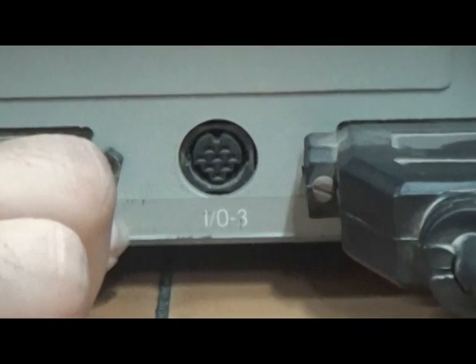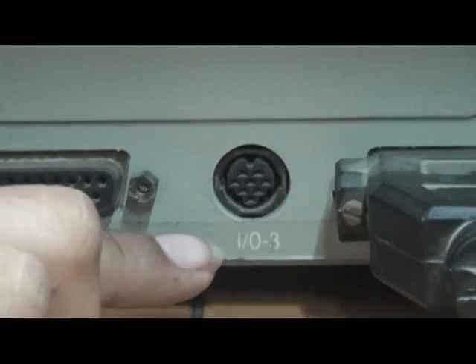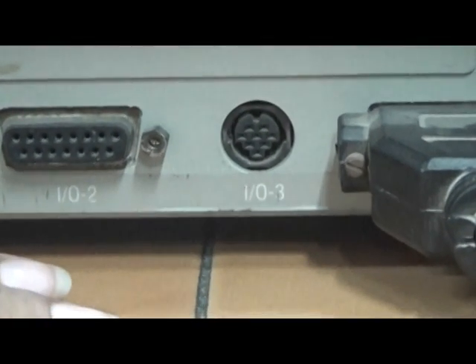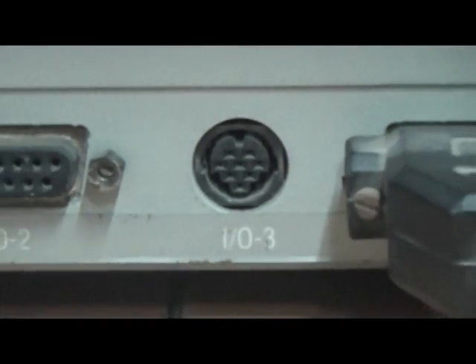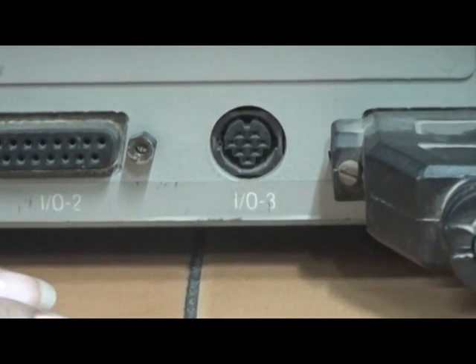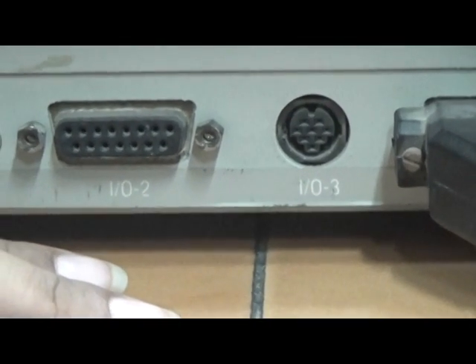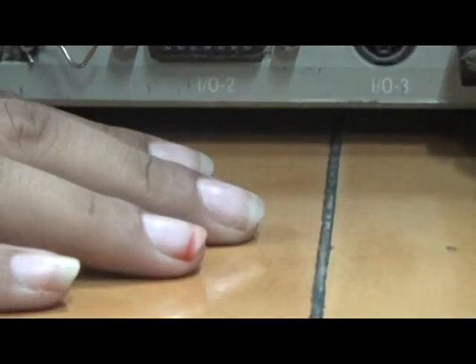Fourth one is the attachment connector, that is input output 3. This is the output interface through which temperature settings are transmitted from the UV 1700 to the temperature regulator when the optional thermoelectrically temperature controlled sipper unit accessory is installed.